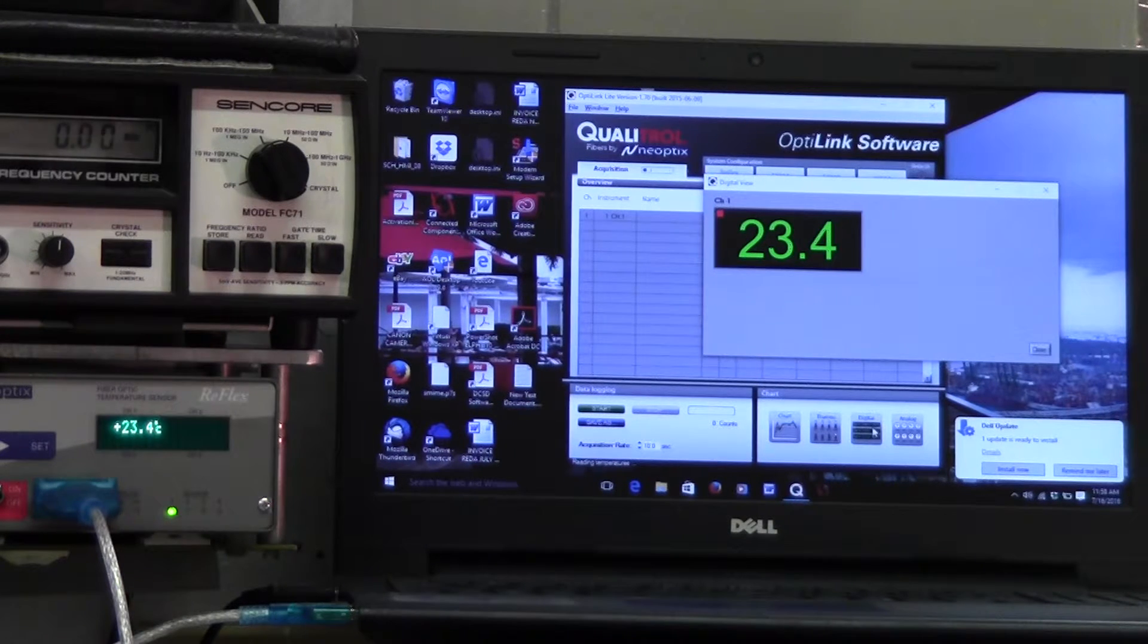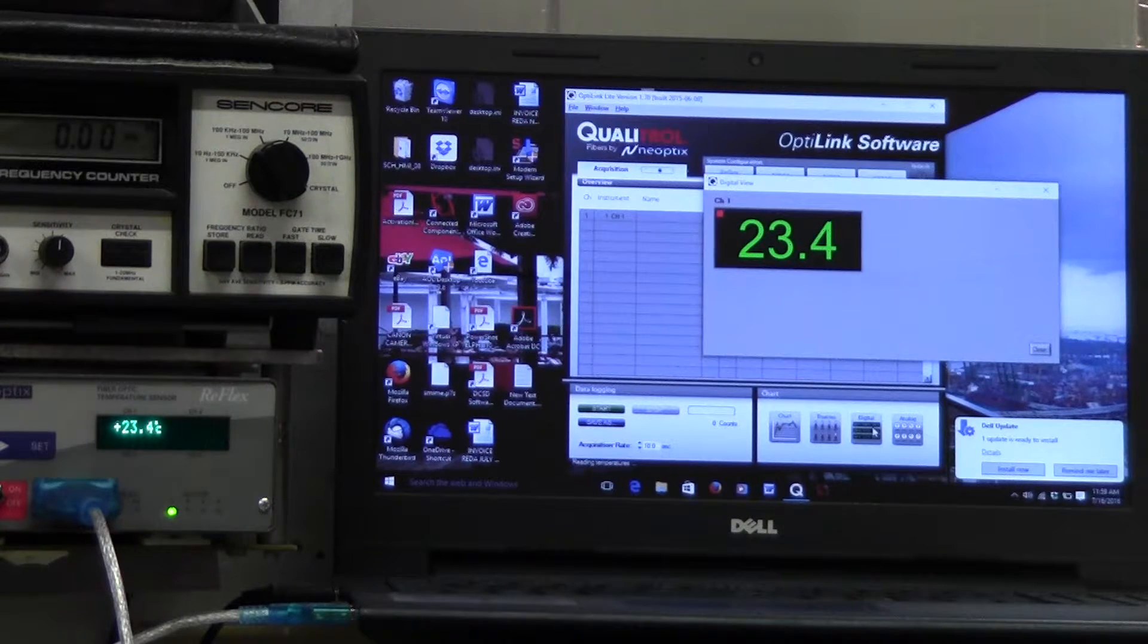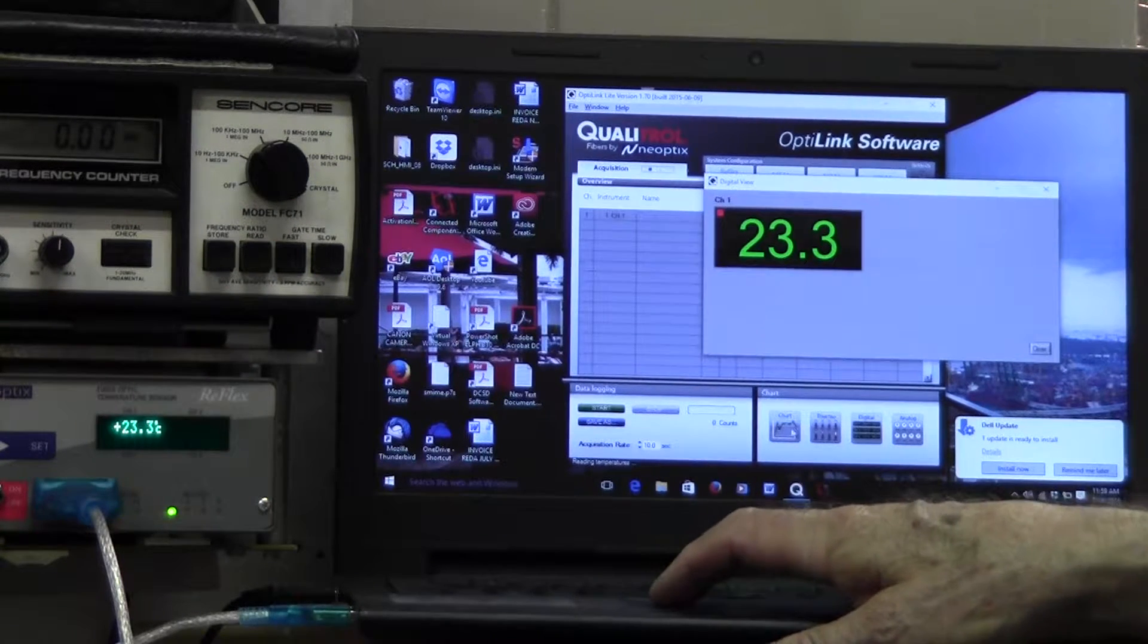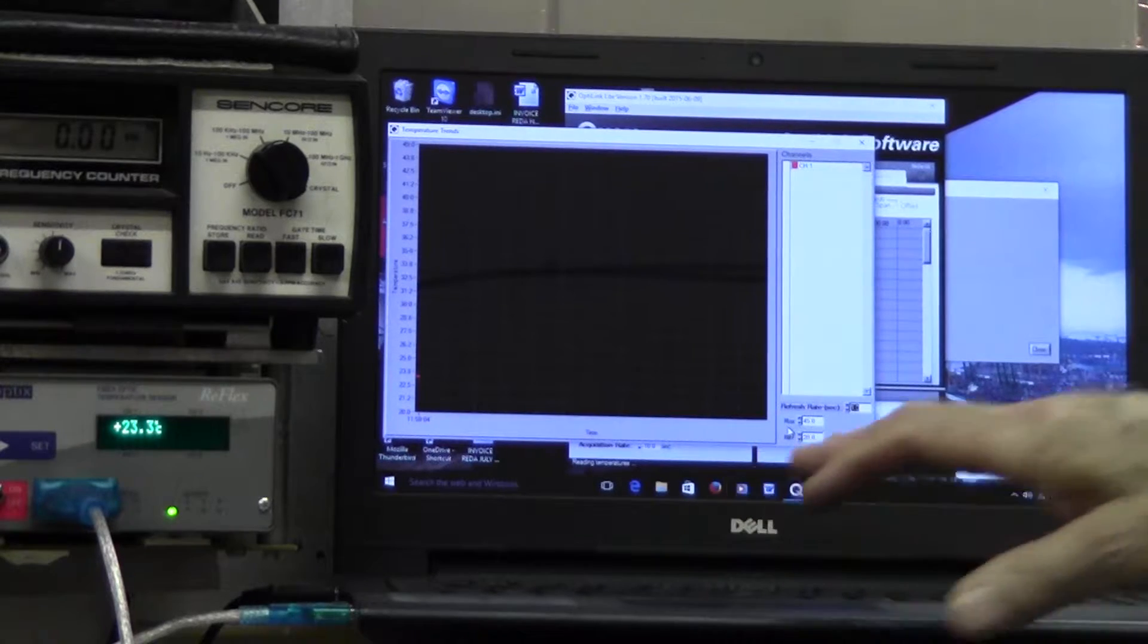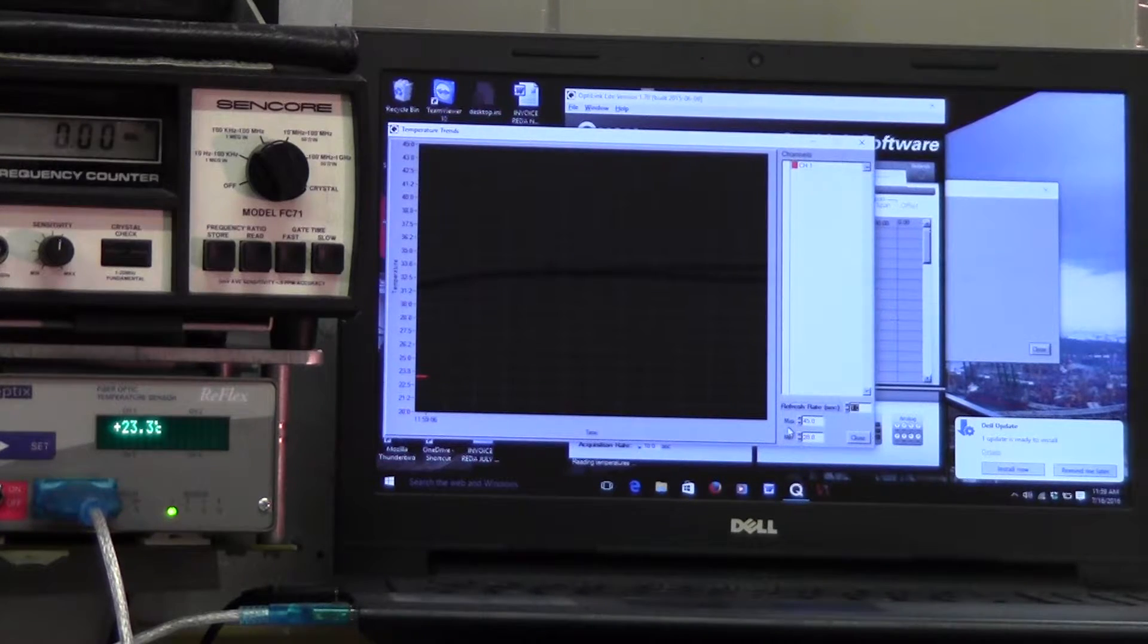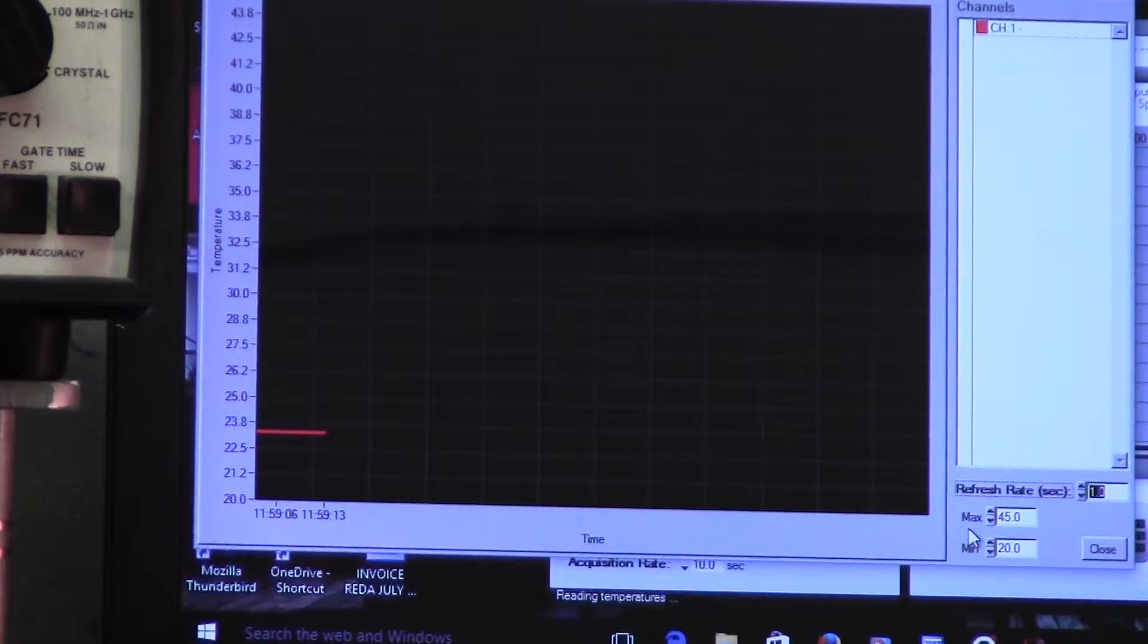Okay, now for a better demonstration, we'll go to a graph. See if we can zoom in better on that. You can see it's kind of flatlining right now. I'll hit the power, and we're at full power, and you'll see it start to climb. Unmistakably. I'll turn the power off.